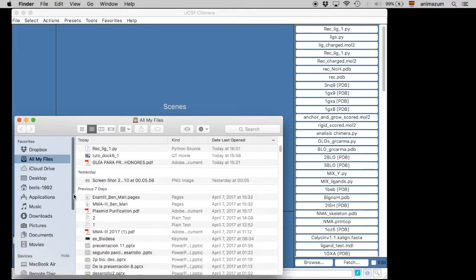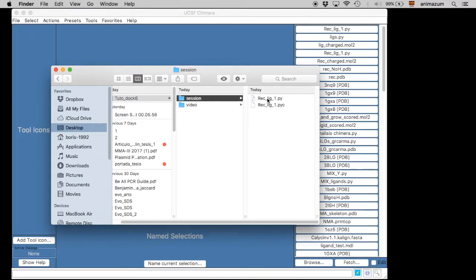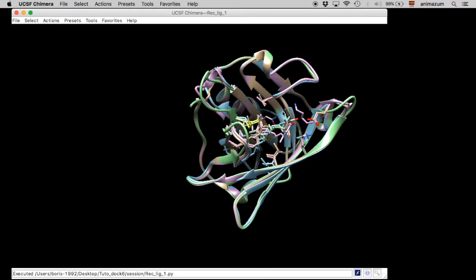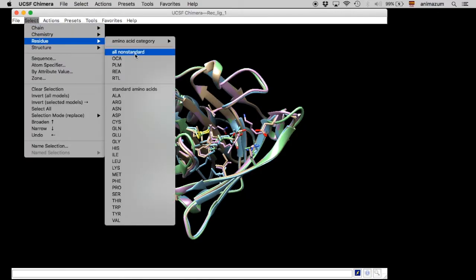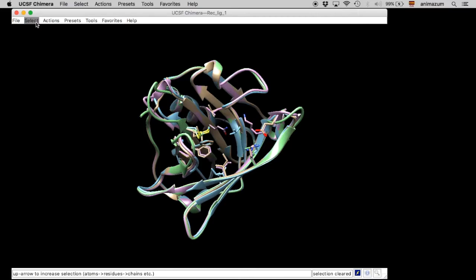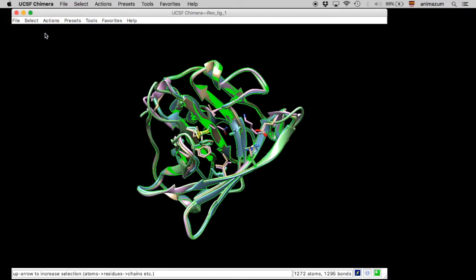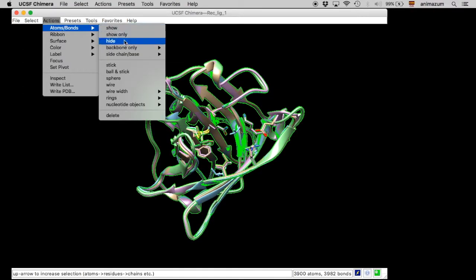Right now we opened the session that we did earlier — I am going to open it just to show you that it works. Here it is. Right now we are going to select all the ligands and then delete them, because I want to prepare the receptor. I am also going to eliminate all the other receptors except one, which is the one I am going to use for the docking.